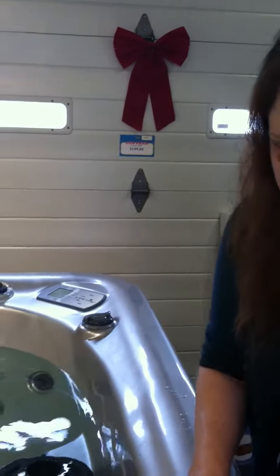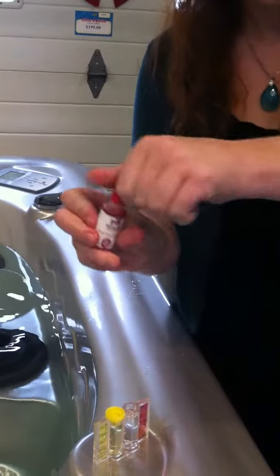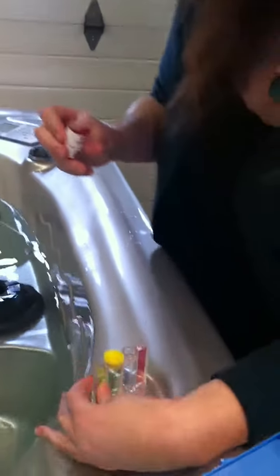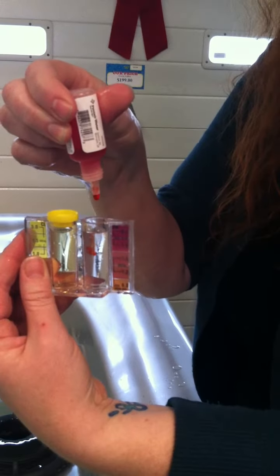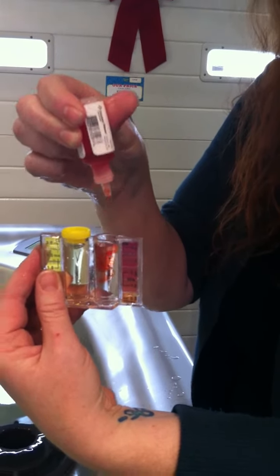Same thing on the pH side except you're going to be using your pH solution. Again doing five drops, straight up and down — one, two, three, four, five — and you're going to cap that side.